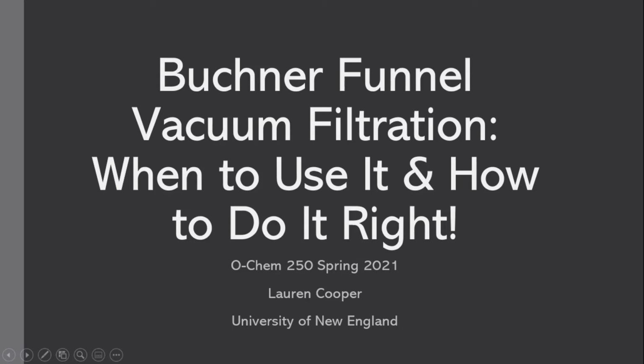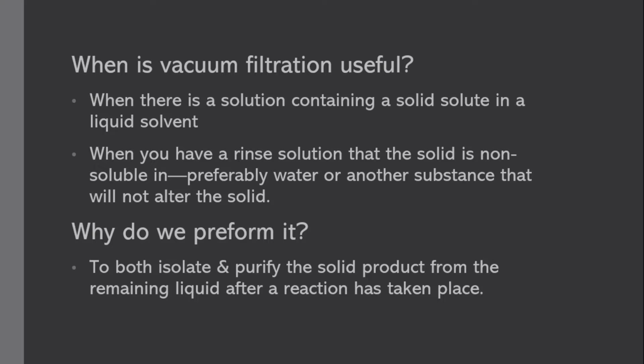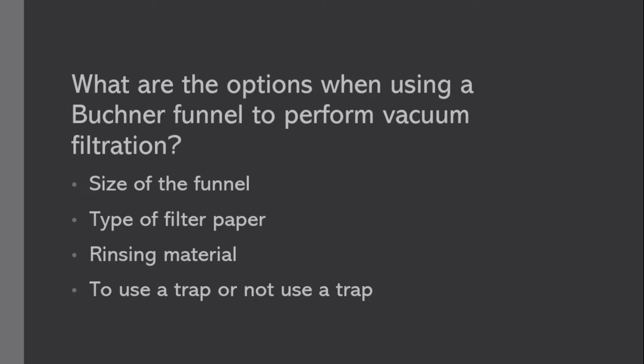Today I'm going to be teaching you the Buchner funnel technique. You would use this technique when you have any mixture that has both a solid and liquid product in it, and you want to isolate and rinse off that solid product so you can use it for any further evaluation.